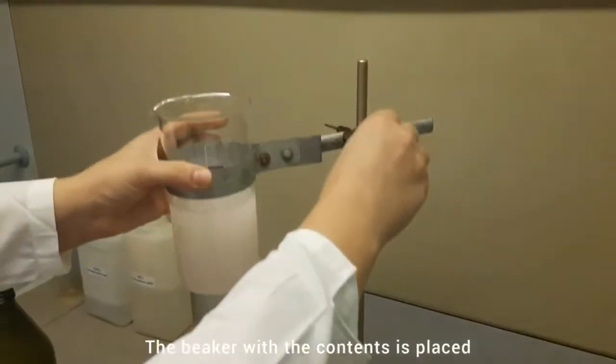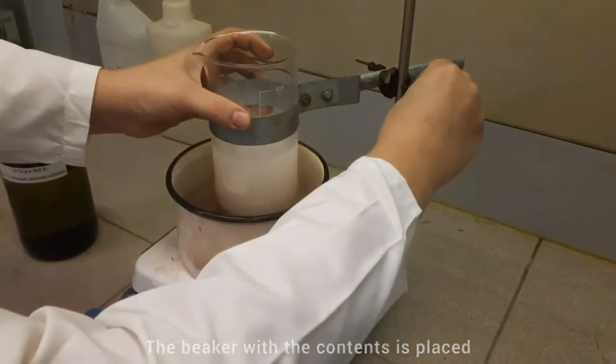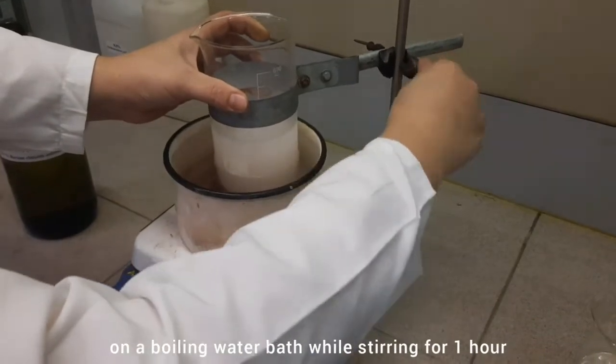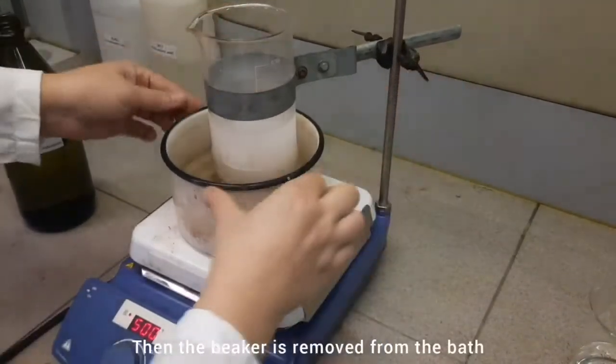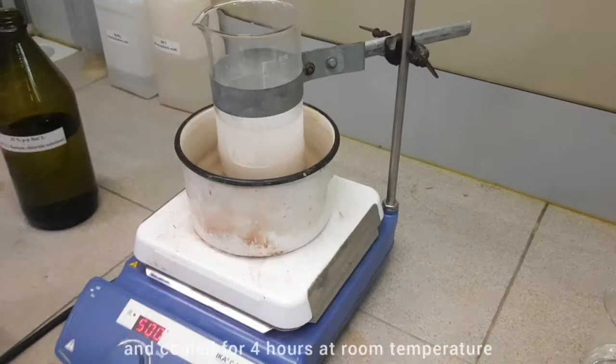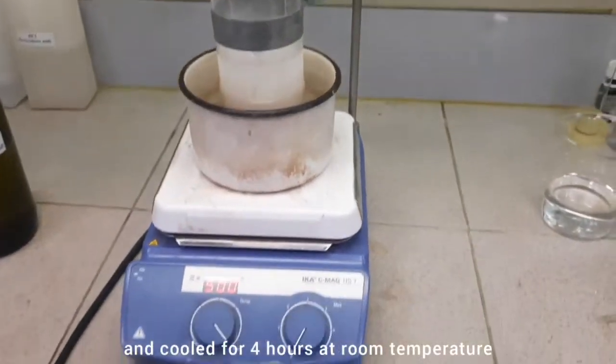The beaker with the contents is placed on a boiling water bath while stirring for 1 hour. Then the beaker is removed from the bath and cooled for 4 hours at room temperature.